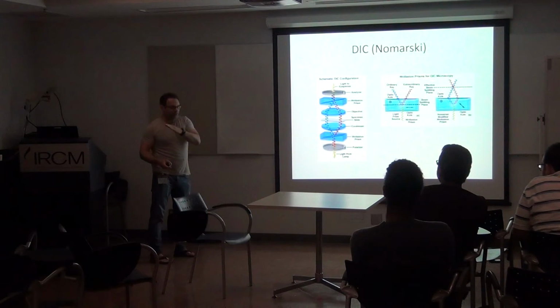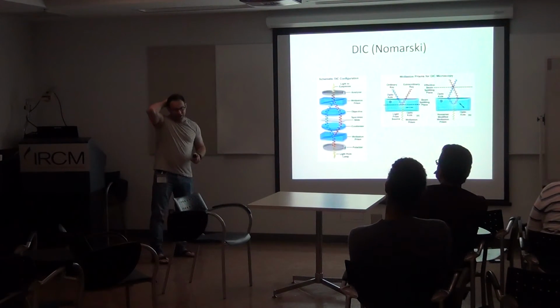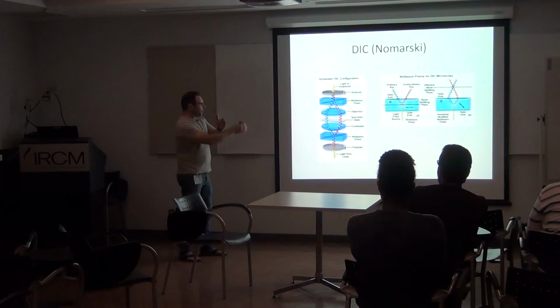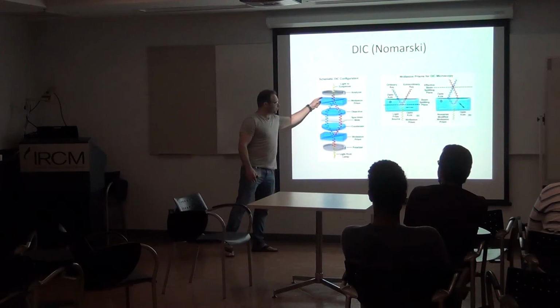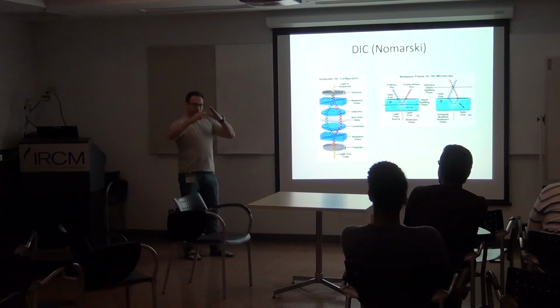And light which is not polarized in the same direction can never interfere. If you want to make interference between one beam of light and the other, they need to be in the same polarized orientation. So that's really nice. Polarized beams in different orientations are not interfering at all. Then he uses another prism, which is the same as this one, but instead of moving the beams apart, it brings them to the same position.